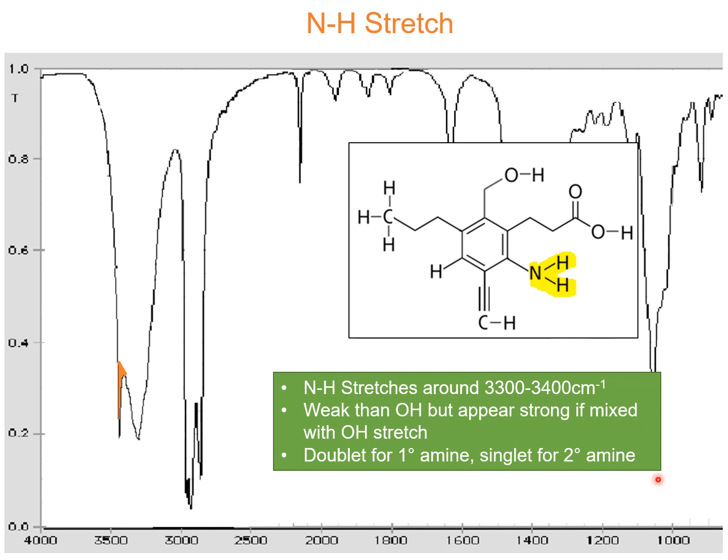If they are present together, then the intensity of this NH stretch will appear stronger. If OH is not present, if it is just an amine, then this sharp peak will appear at the top. Usually NH stretches have very weak intensity compared to OH stretches, but because it has now come together with OH, it has strong intensity.